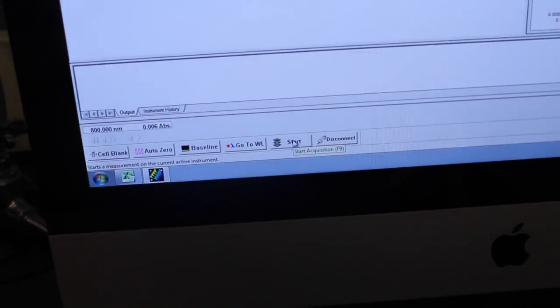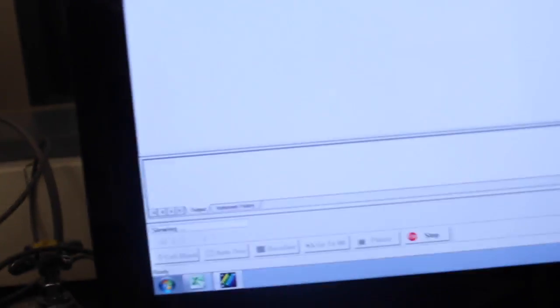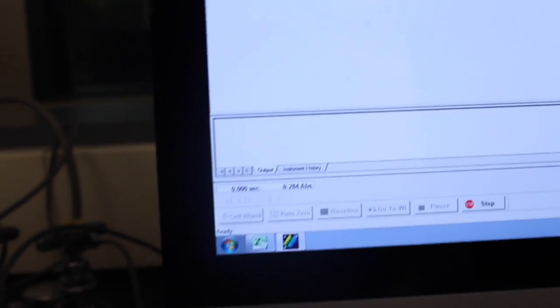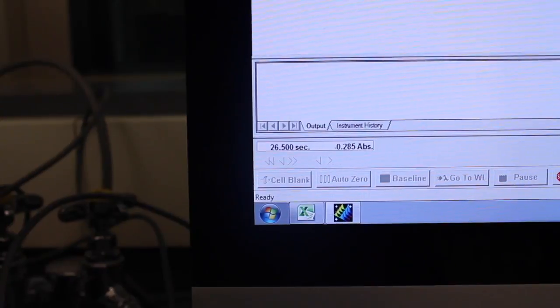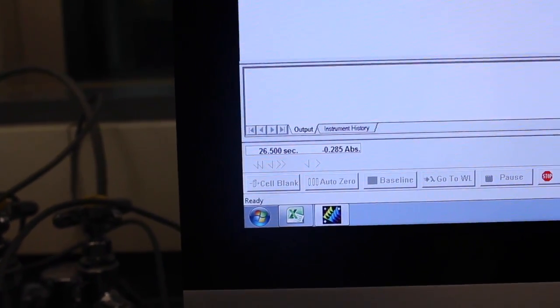Click the start button on the bottom of the computer screen. Choose the overlay graph option on the upper right hand side of the screen. The machine will run your sample and give you an absorbance value.